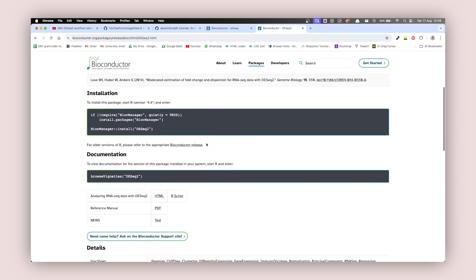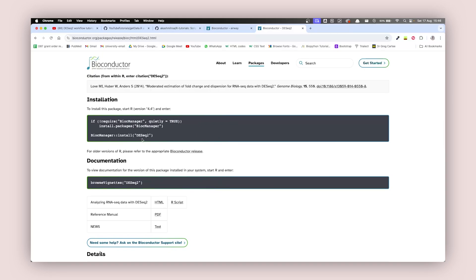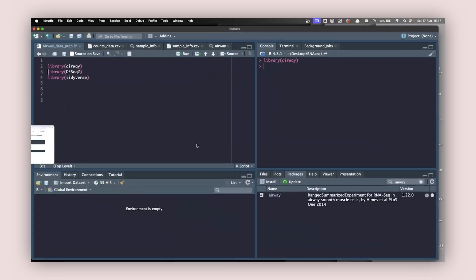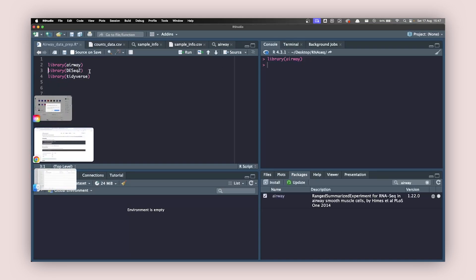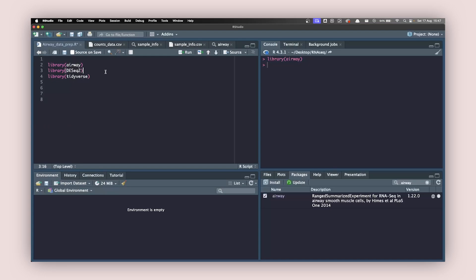Go down to the installation part, copy the command, come back to RStudio, paste it in your console, and install DESeq2. Once installed, call DESeq2 inside your working environment: library DESeq2, and hit Command+Enter. Now DESeq2 is loaded inside your environment.